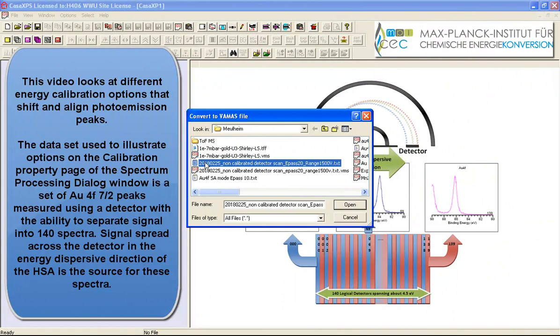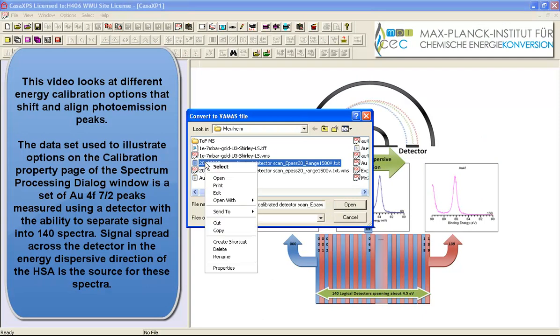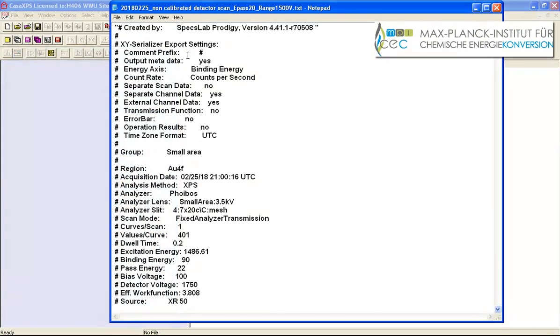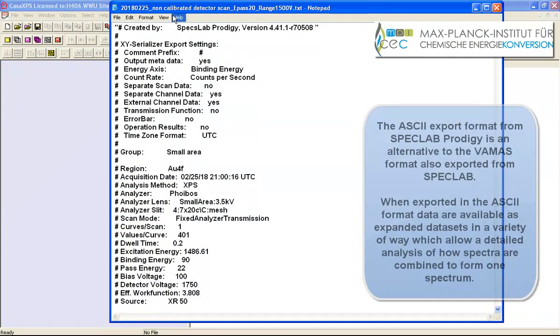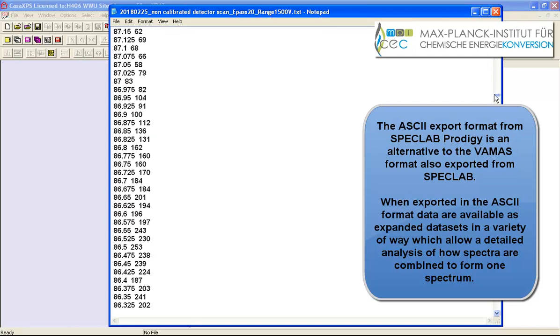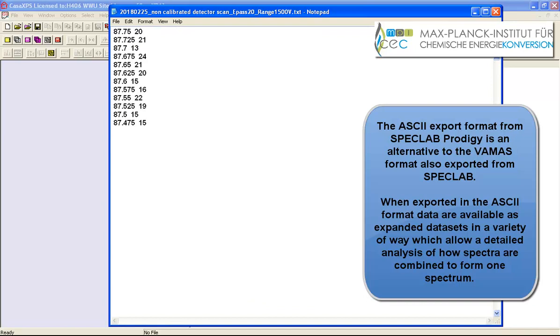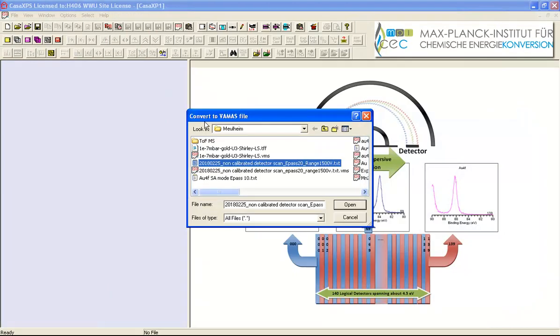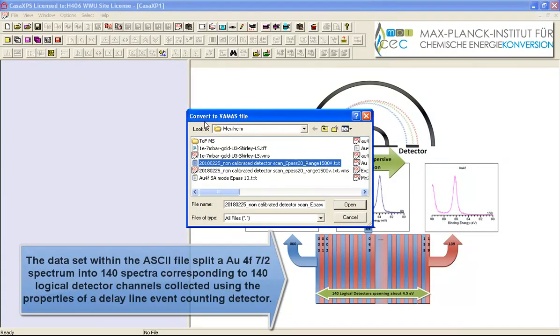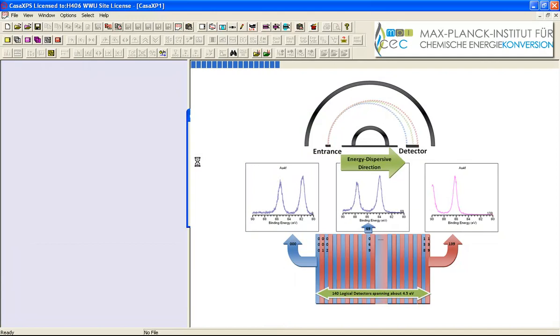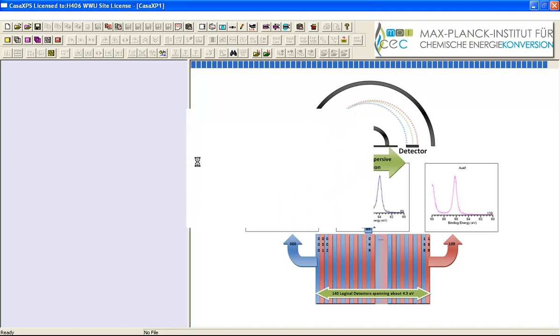These data are text files that have been generated by a SpexLab Prodigy system and these are ASCII data that are not in the VAMAS format although Prodigy will export VAMAS files. This is an example where the data have been kept separate so that more information can be gleaned from the data. Data in this format can be converted using the Convert to VAMAS file dialog window and if we select this file then the data are read and converted to a new VAMAS file and then opened in CASA XPS.